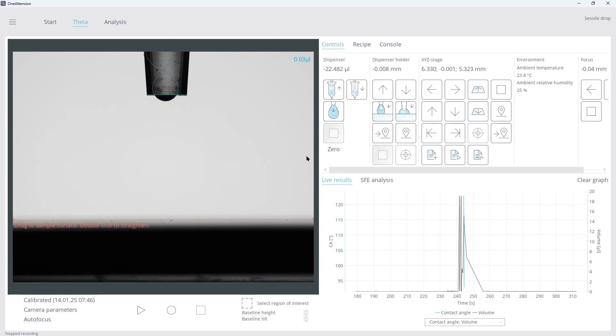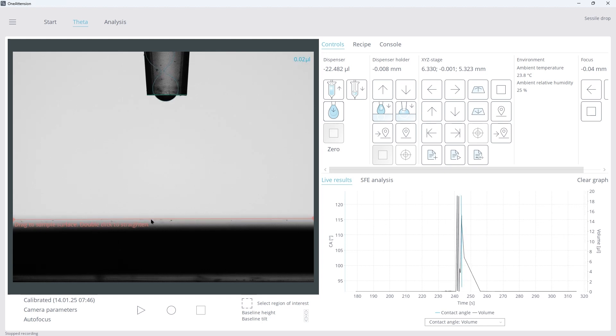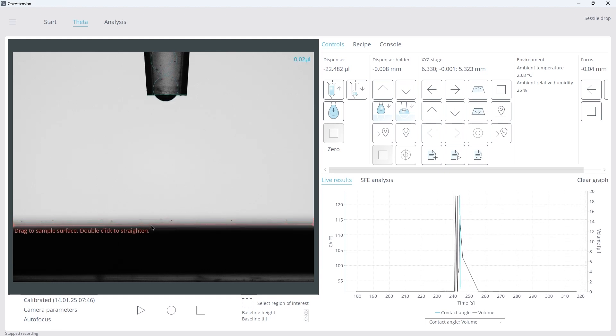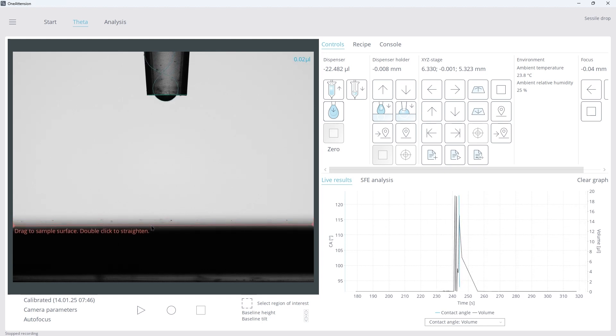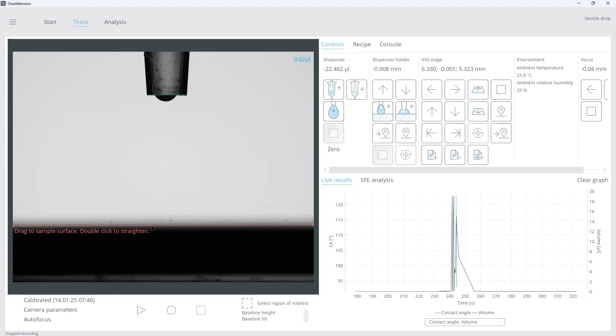Drag the red sample surface bar to mark the sample surface on the camera. This helps the software to determine the distance needed to lower the pipette tip for accurate droplet placement on the sample surface.